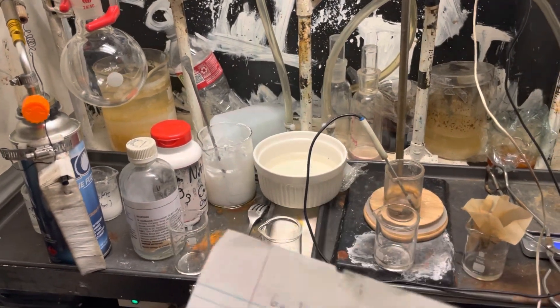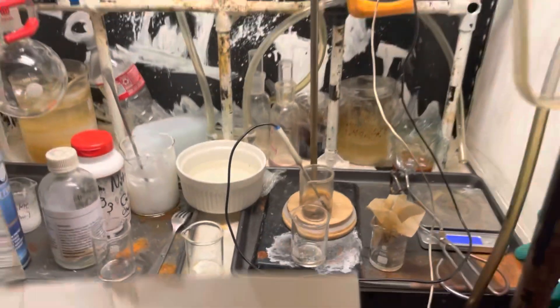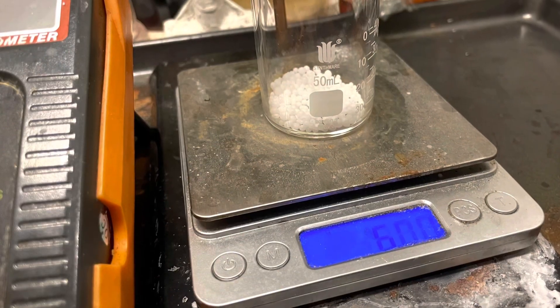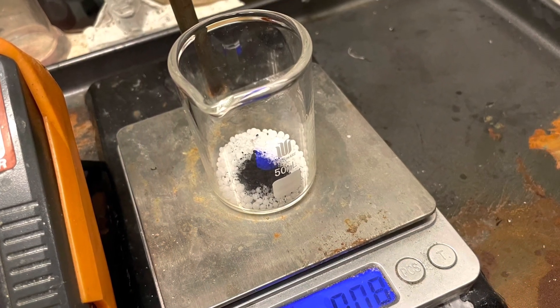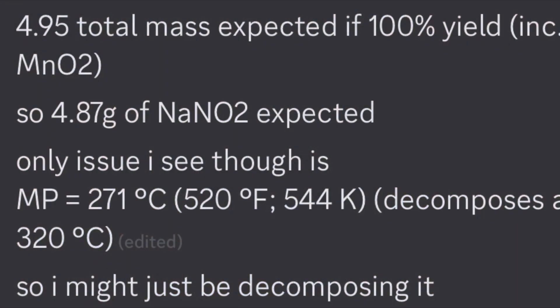But basically, I've been testing ways to make nitrite. The first method I tested was conversion of nitrate to nitrite by thermal decomposition. We used 6 grams of sodium nitrate and 0.08 grams of manganese dioxide as a catalyst. And theoretically, I should get about 4-point-something grams of sodium nitrite.